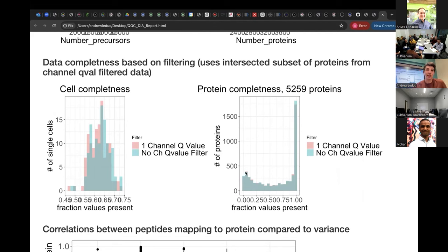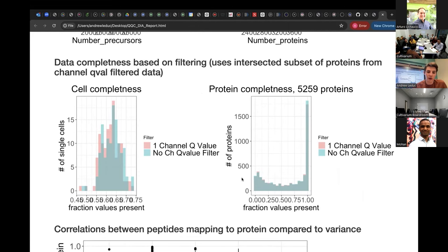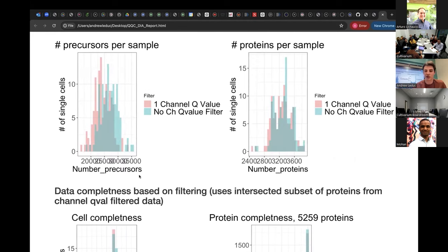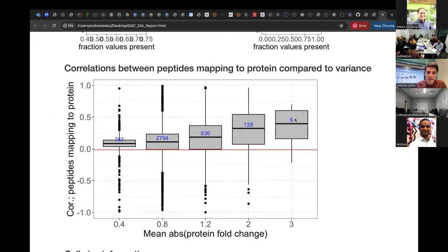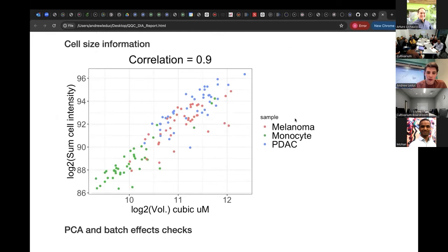There's some proteins down here where we only identified them in a small minority of cells, and that can be for a number of reasons. Similarly, this is the converse. So if we have 5,000 proteins in the data set, on average, a cell is getting about 60% of those proteins, which again is just going to correspond to this distribution. It's a little bit less informative. We'll skip that for a second.